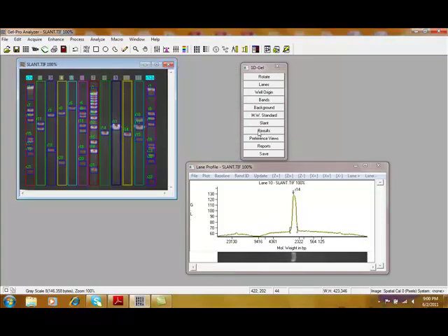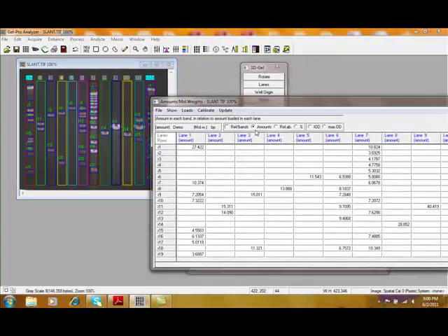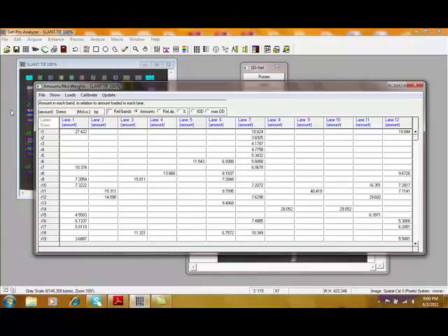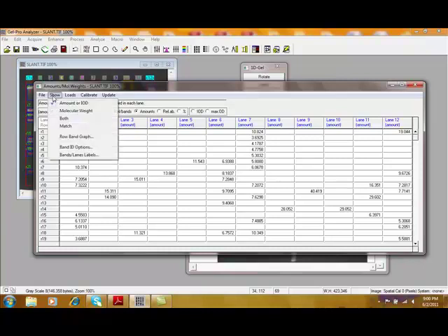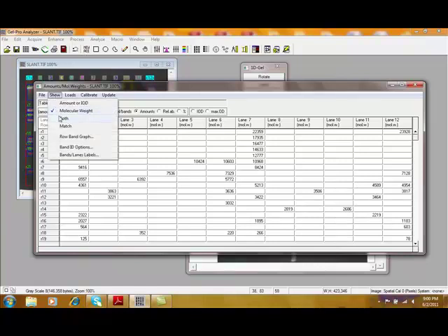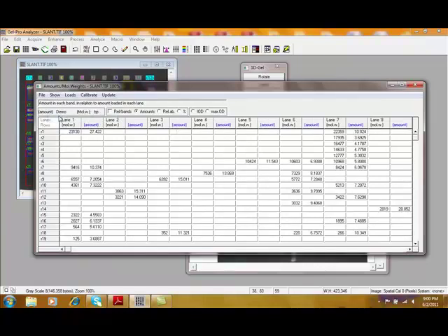And now, simply I can press the results button. And this will bring up the table and show for each row, each band is detected. And lane, it'll show the amount of DNA. From here, there's a couple of choices. We can show the amount. We can also show the molecular weight of the bands based upon rows 1 and 12. And then, for all the bands we've detected, we can show the molecular weight. And we can also show both those at the same time.